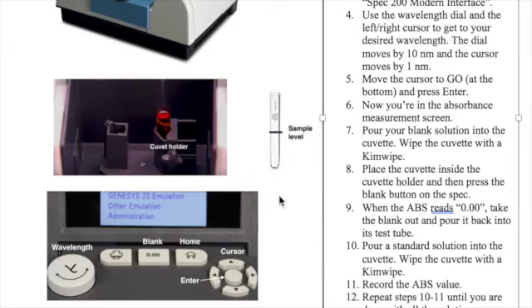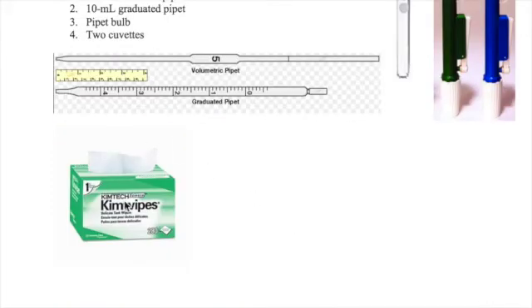When using the spec, you will pour your sample from the test tube into a cuvette until about half the height of the cuvette as shown here. Note that the cuvette is shaped like a test tube so make sure you distinguish the two. Wipe the outside of the cuvette with a kimwipe which is shown here.